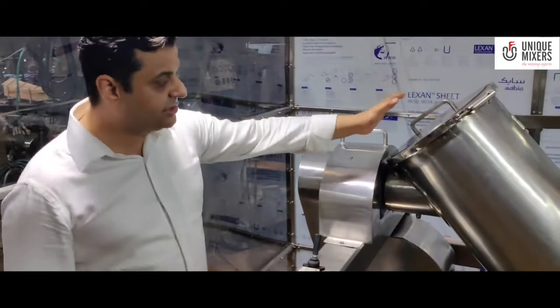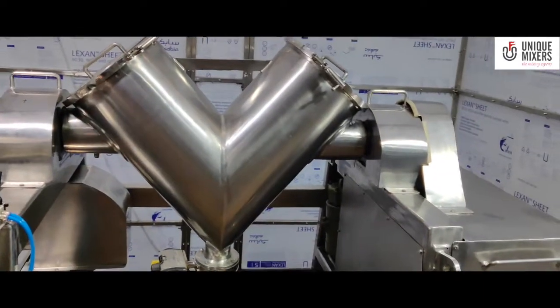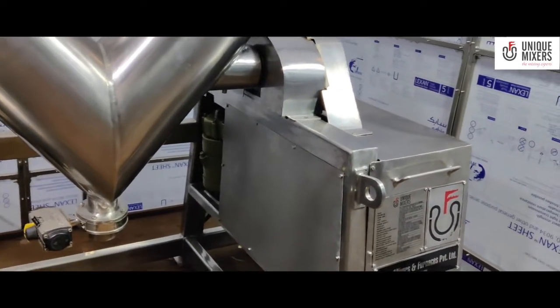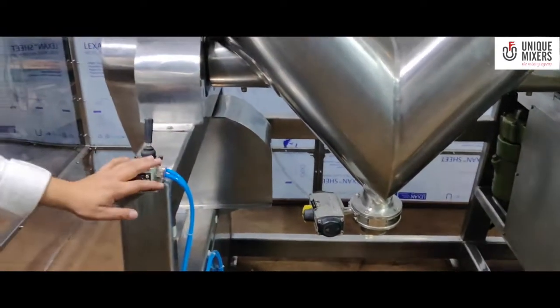The material is charged from the top. The machine is then rotated, the shell is then rotated. That's where the blending happens, and after the blending is completed we have a discharge valve here from which the product gets discharged.